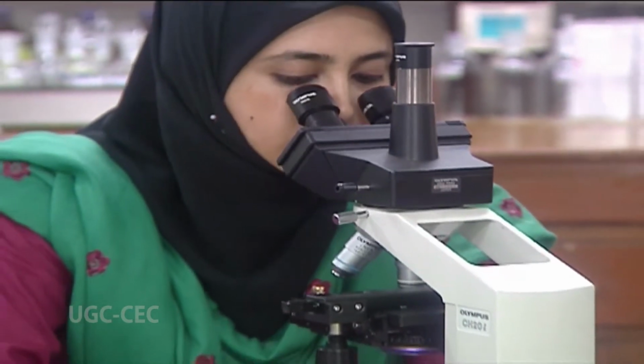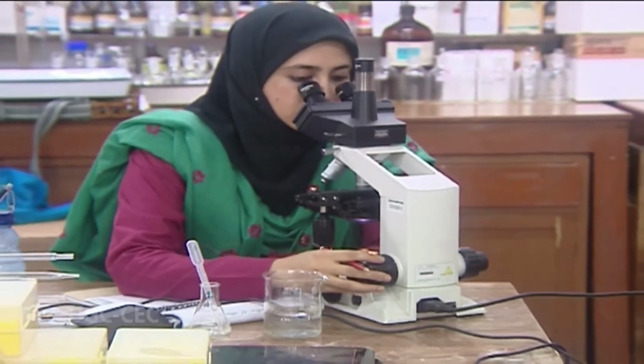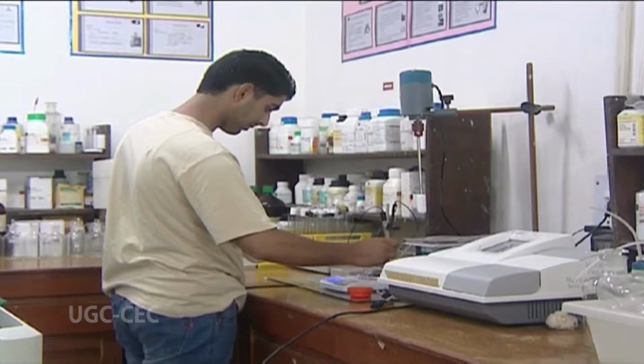There are many applications of optical microscopy such as in nanophysics and biotechnology, but in medicine it is mostly known as being used in diagnosis when we are dealing with tissues or tests on free cells, which are known as smear tests.